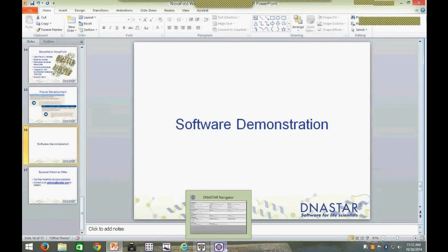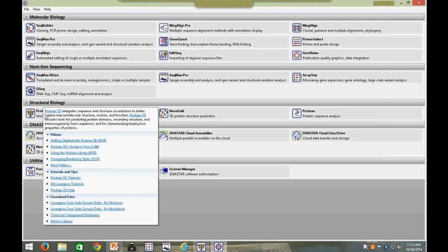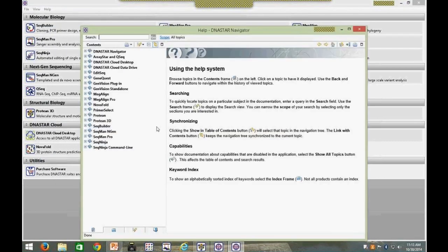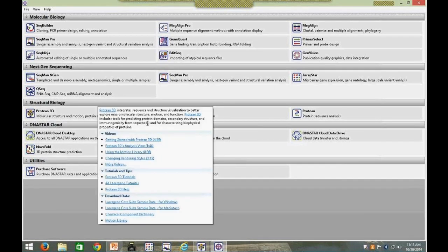The first application I'm going to open up is our DNA Star Navigator — our guide to all DNA Star applications. In looking at the Navigator, you can quickly view a summary of all applications available to you. Hovering over any of these icons shows an in-depth description of that application and access to additional resources such as videos, tutorials, or demo data. The Navigator is also fully integrated with our searchable online help system. From here I'm going to open up our Protein3D application and walk you through its features before we dive into NovaFold.